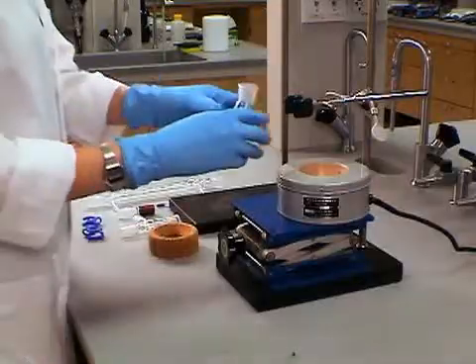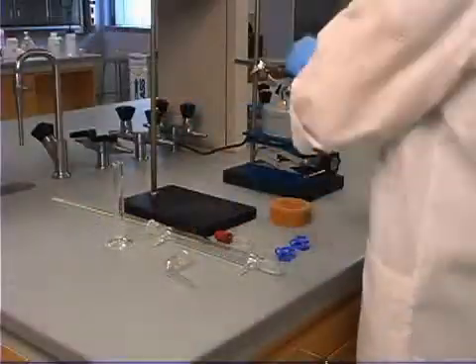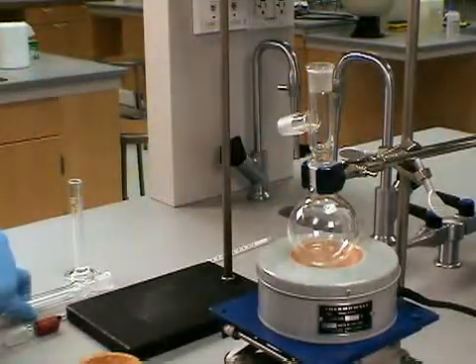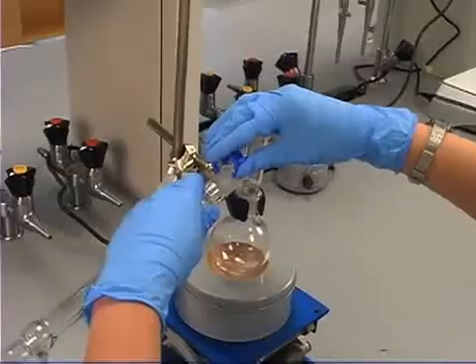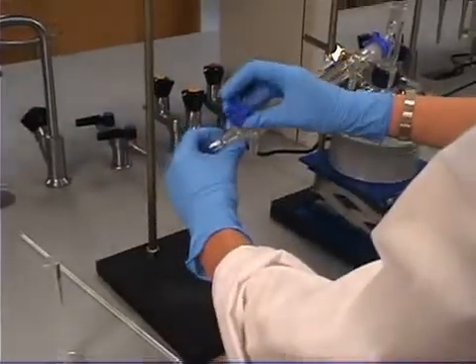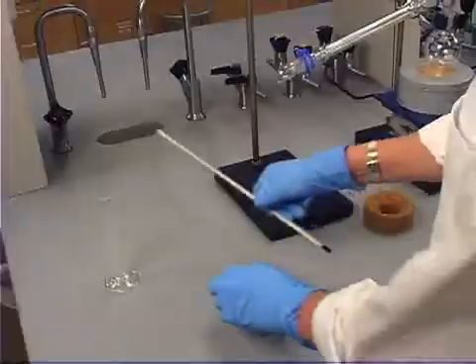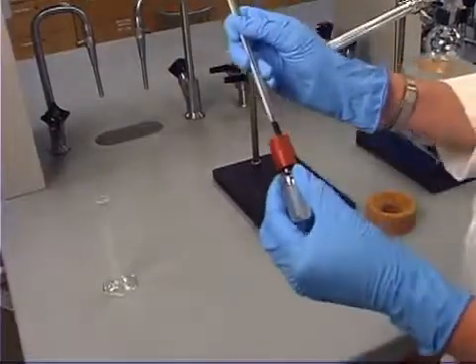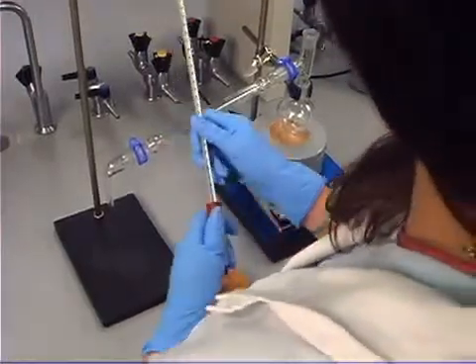Let's begin by setting up a simple distillation. Secure a round bottom flask above a heating mantle. Now place a distillation adapter on the round bottom flask. Clamp a condenser into the adapter with a keck clip. Clamp a bent adapter to the condenser. Insert a thermometer through the rubber septa on the adapter and connect it on top of the distillation adapter.